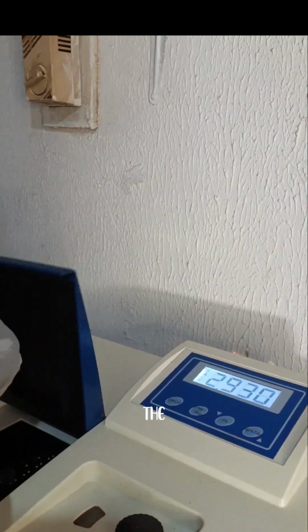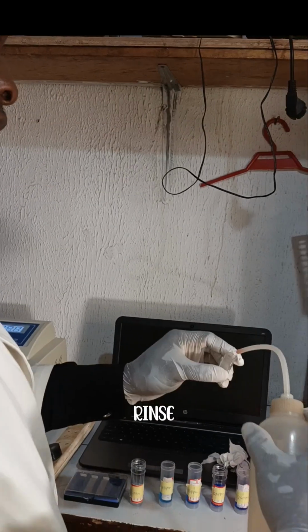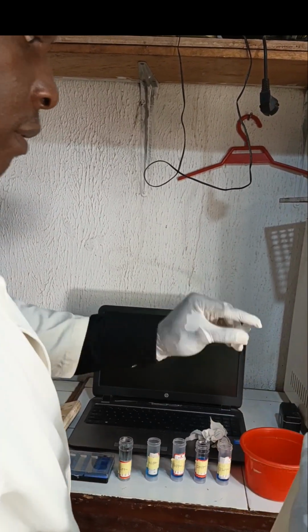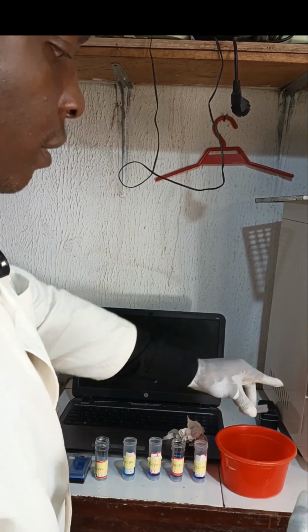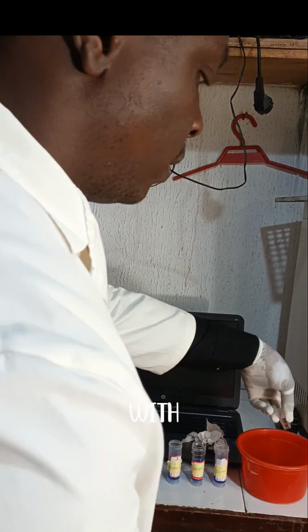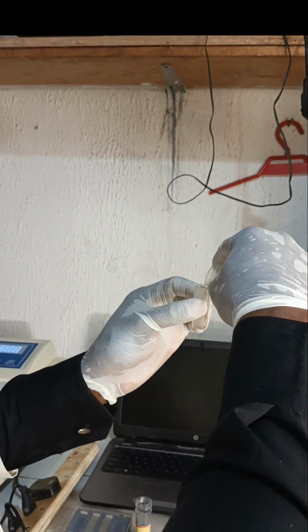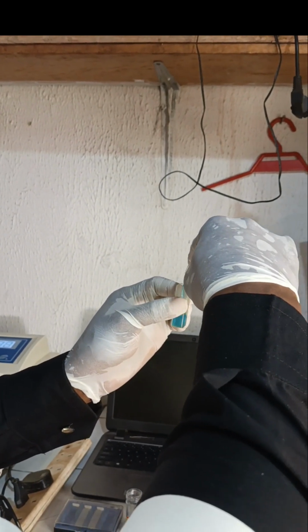So I have to remove the 5 ppm, and then rinse the cuvette with distilled water. Then we add the 10 ppm.